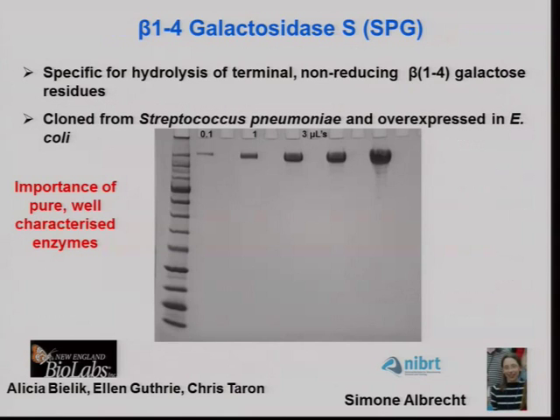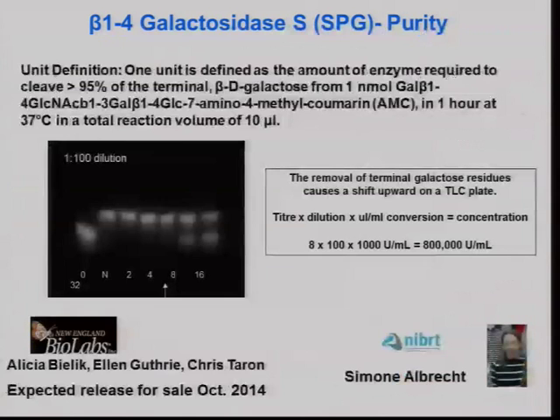Now, if you just take some of the enzymes that you buy, you just run them on an SDS page, you will be surprised how much junk there is in some of these enzymes. So, they're not well characterized, and you can use them, but you need to be aware that there are hidden problems if you do.